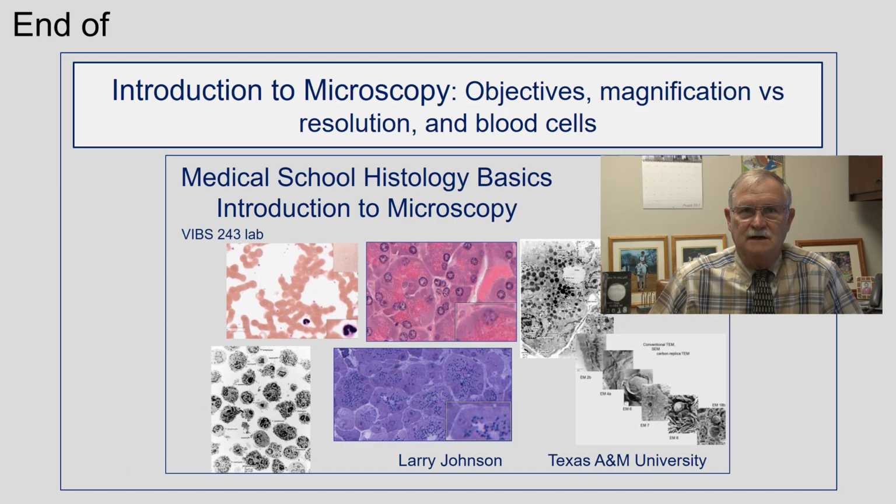So this is the end of the introduction to microscopy, the objectives of the overall talk on microscopy, magnification, resolution, and blood cells. Thank you.